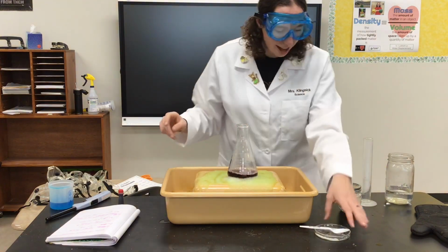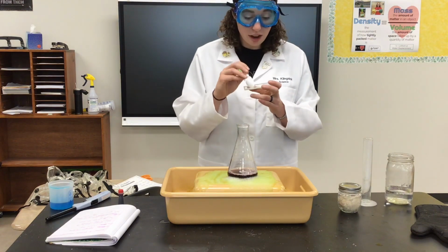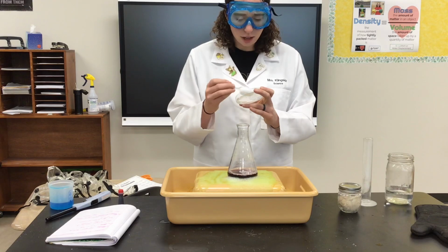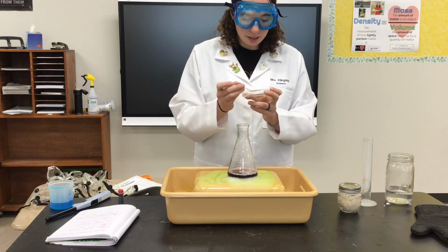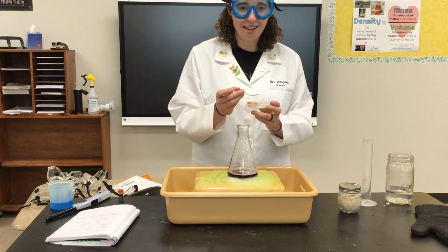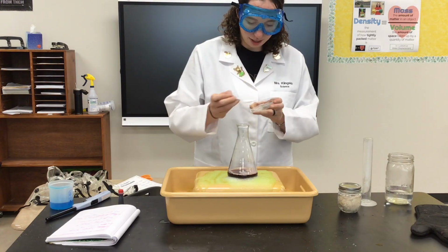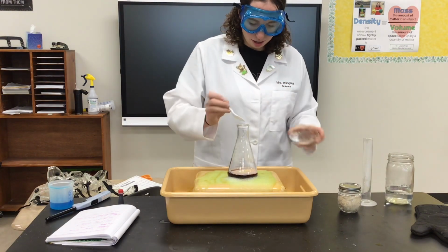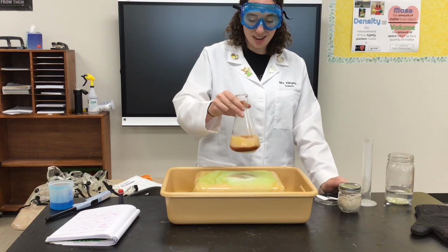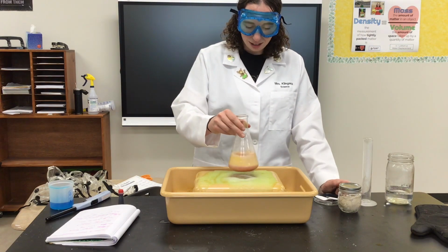Okay, so now I'm going to add in potassium iodide. Now, potassium is the stuff that you find in bananas and potatoes. It's actually known as a metal. It's in our periodic table. But this is potassium iodide, so it's mixed with iodide. So I'm actually gonna now add this in and we're gonna see if we can have any chemical changes. Here we go. All this in. You can already kind of see it's starting to turn a new color. It's turning yellow, orange. So that's another sign of a chemical change. So that's one.